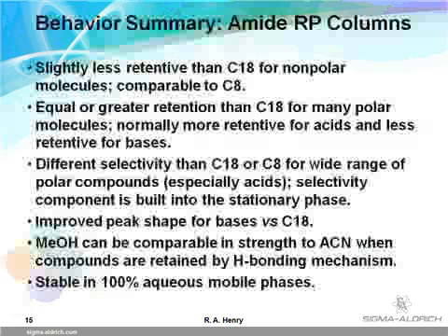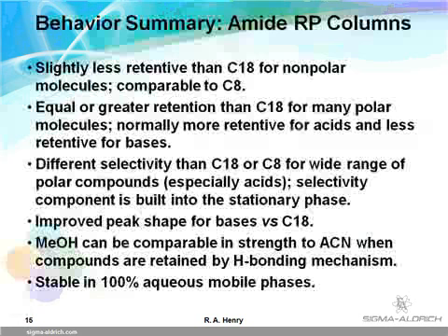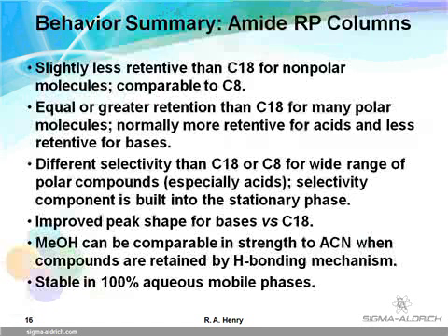The next slide summarizes Ascentis RP Amide behavior. Retention usually lies between C18 and C8 for nonpolar compounds. But RP Amide can be more retentive and selective for polar solutes, especially those that are attracted to the amide group by their ability to hydrogen bond, especially acids.